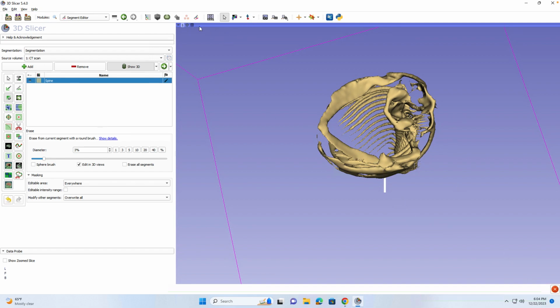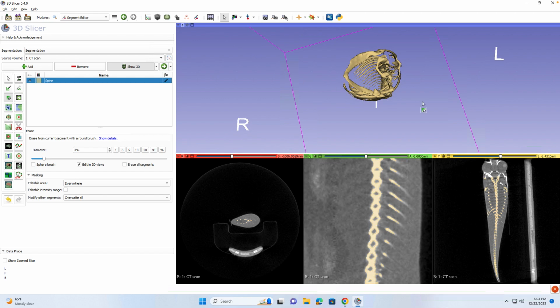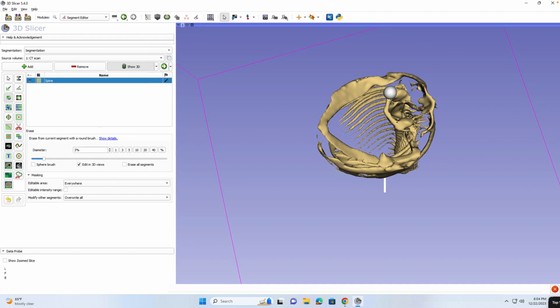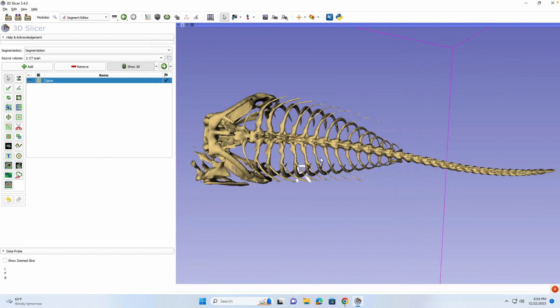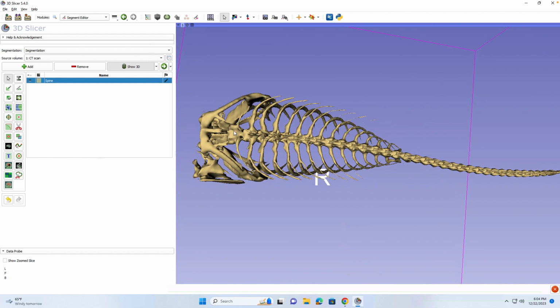Oops, I don't know what just happened. Give me a second. Okay. We actually can full screen it if we want to, but okay. So this is probably where we're going to start it.